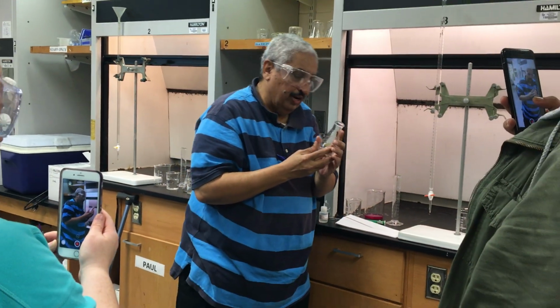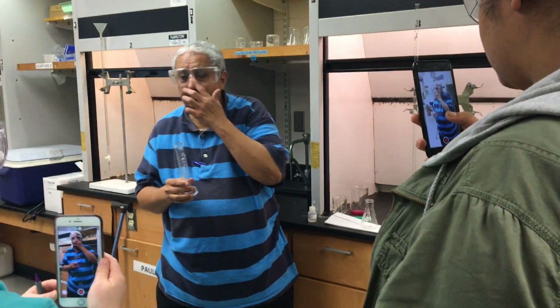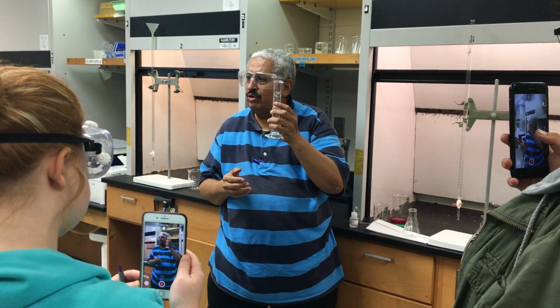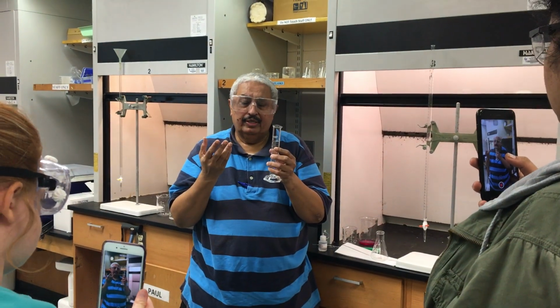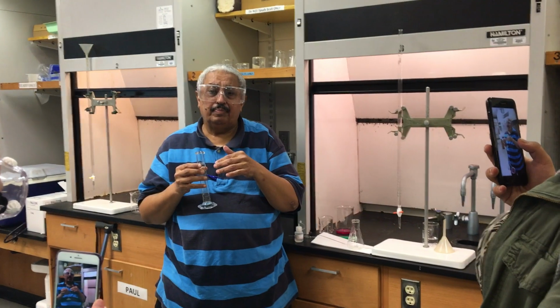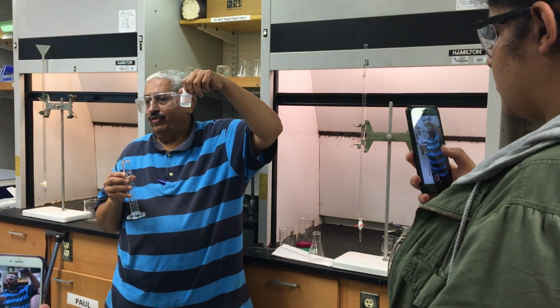So what do we have to add? We have to add 10 mL of distilled H2O, 10 mL. You can add 20 mL, it doesn't really matter. So I use H2O to help me to see the end point. The end point will come from acetic acid colorless, correct, to what? To a pink color. I'm using an indicator for this. The indicator is called phenolphthalein.